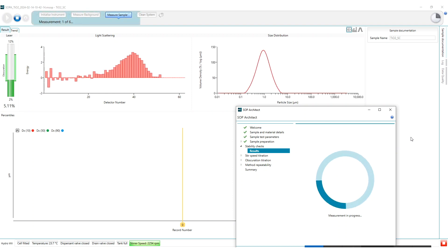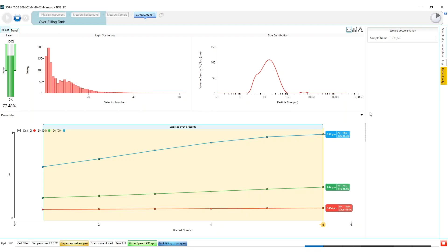So now that it's started measuring it's going to be looking at key considerations such as the scattering data feature and the relative standard deviations to take into account whether our sample is stable. So it will be able to tell us if our sample is dissolving, agglomerating or still dispersing over time. As you can see by looking at the trend view our sample isn't stable.